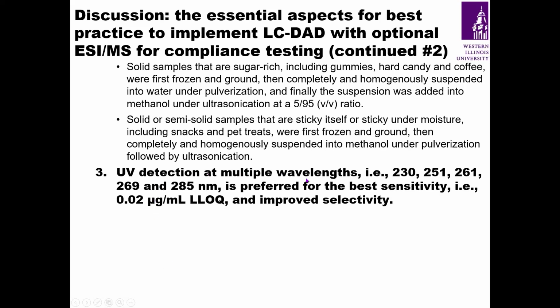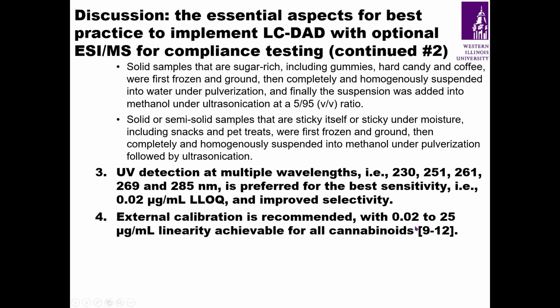UV detection at multiple wavelengths is preferred for the best sensitivity, 0.02 microgram per milliliter LLOQ, and improved selectivity. External calibration is recommended because it's simple. A calibration range of 0.02 to 25 microgram per milliliter can be accessed.